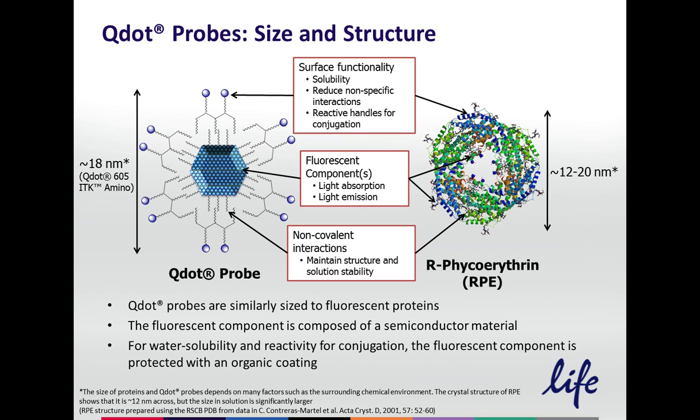And there are not many ways to control the blinking. The blinking is actually a good thing if you're doing super resolution imaging, like single molecule. It fits with the algorithm used in those techniques.